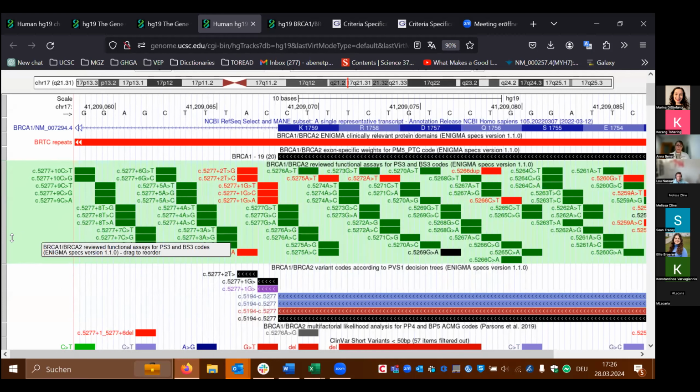the people in our lab, it's a group of 35 people doing variant interpretation from exome and genome data, and they are very, very happy about that, I would say, because it has sped things up very much. They are much faster in gathering the data from all these Excel tables and do not have to consult all the tables. And so since we did this, we thought we could share it with the ClinGen group.